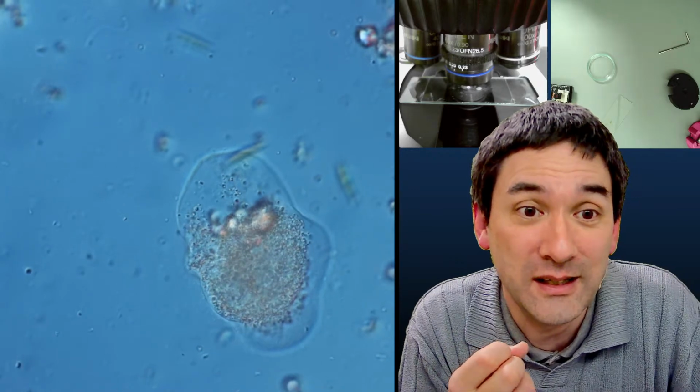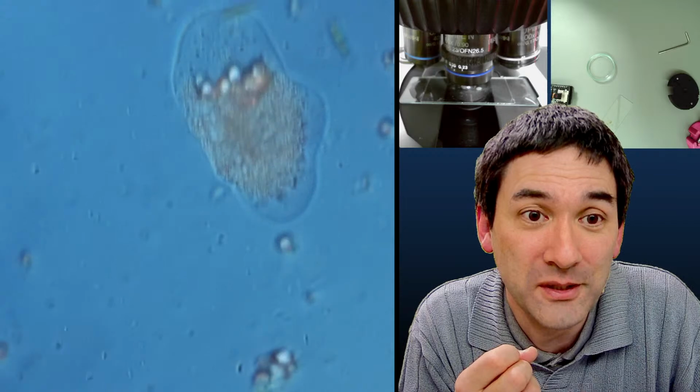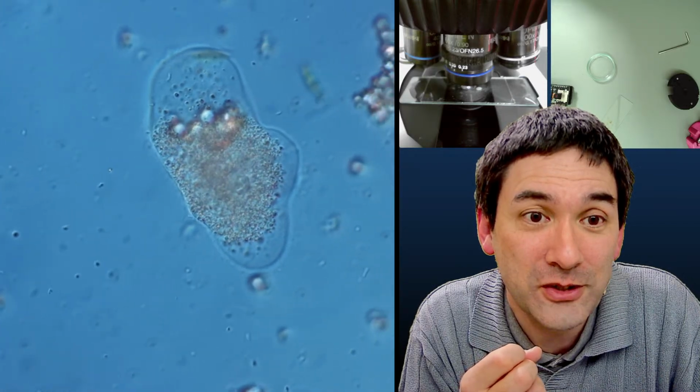Look, I think this is an amoeba. Look, this was an amoeba. Now it's starting to move a little bit.